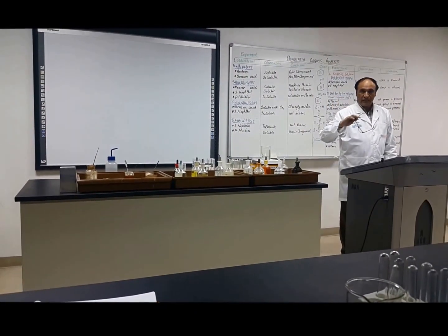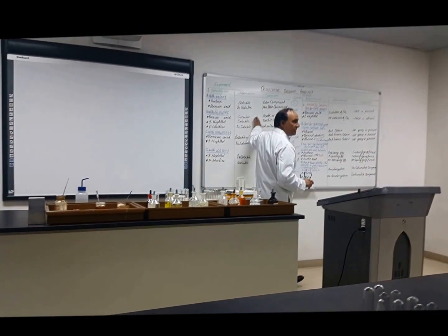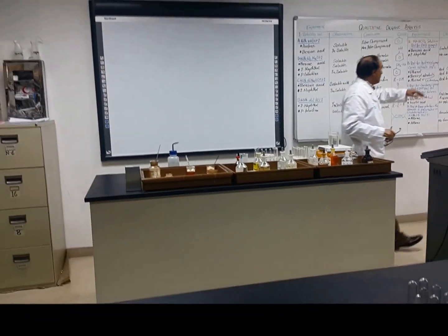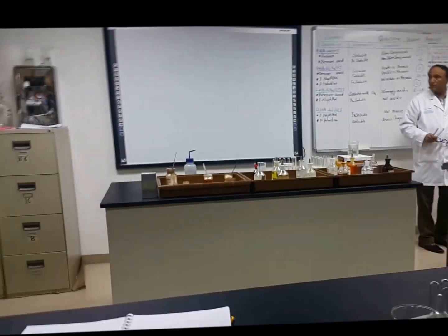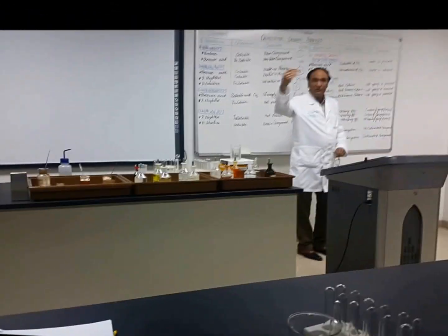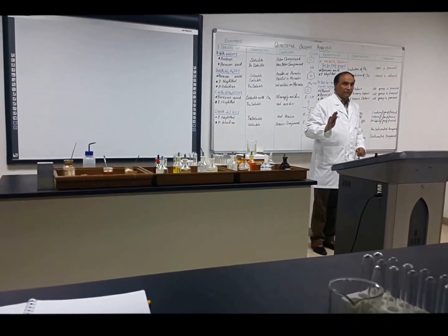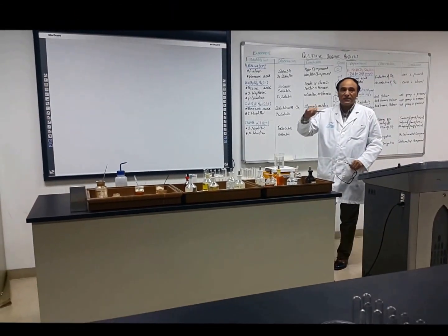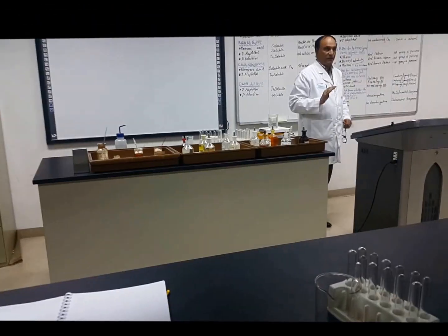When you come next time, you will do one part only, solubility. After that, when you come, you will do the next part, the functional group. So, the experiment is in two parts. You will do it one by one, but I will do it all together today. So, look carefully. If you have any questions, any doubt, anything you don't understand, you can ask me.